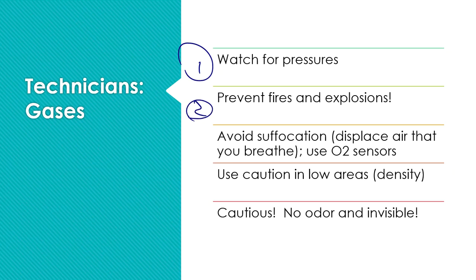Number two, you want to make sure that anything flammable stays away from these compressed gases. Think about hairspray in a can, right? It is aerosol. It is under pressure. If you throw that can into a flame, pressure is going to build up and pressure is going to go boom, all right? And I don't want that to happen. That's why it says keep away from flame and hot objects. That's why that kind of warning is on there.